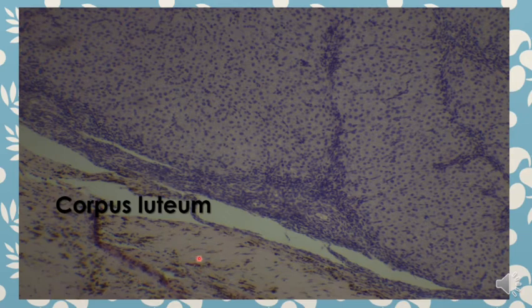This is the theca externa. Again, the corpus luteum consists of two layers: hypertrophic, light staining granulosa lutein cells derived from the granulosa cells, and the dark staining cells located at the periphery, in the folds of and surrounding the granulosa lutein cells.